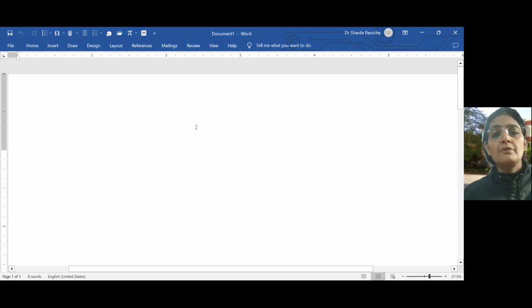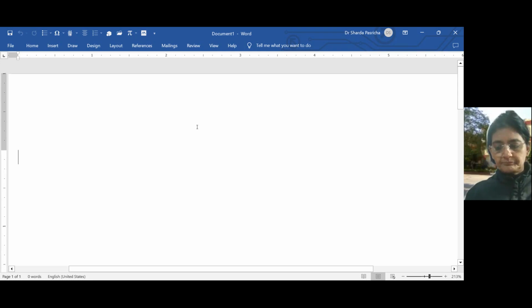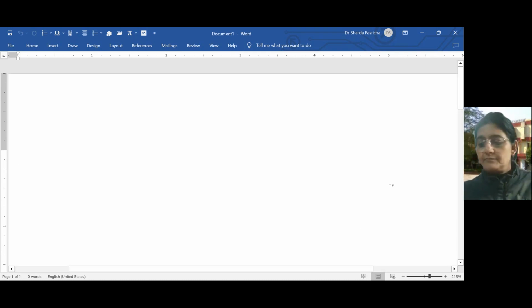So today we are going to talk about the estimation of aniline solution by bromate-bromide. First, understand the theory behind this.